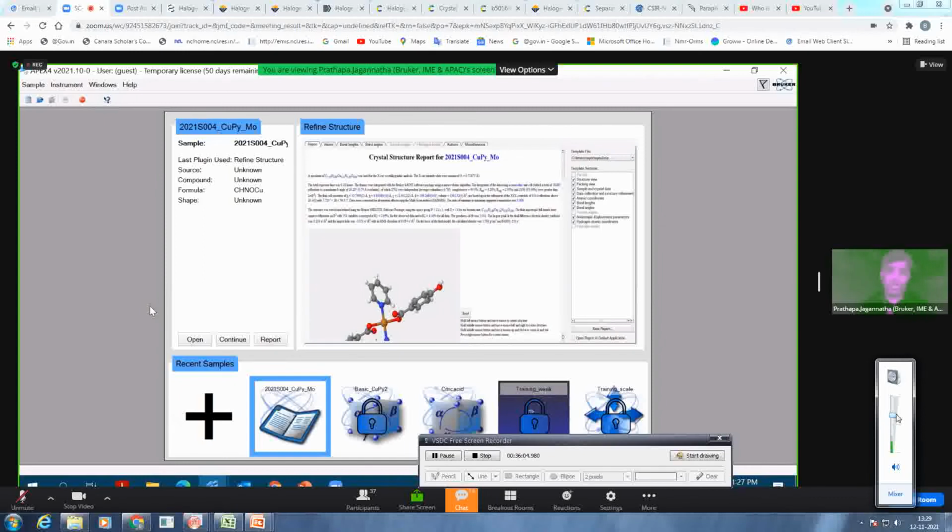It also gives you a lot of feedback, as Kenji showed while he was collecting, about how it is collecting and what the exposure time is. You can have control over the data collection time as well. You can tell Structure Now to finish the data in 1 hour or finish the data up to a certain resolution. So you don't need to use the auto option. You have an option to finish in 1 hour or 2 hours or 3 hours. Accordingly, Structure Now adjusts the parameters and then collects the data for you.